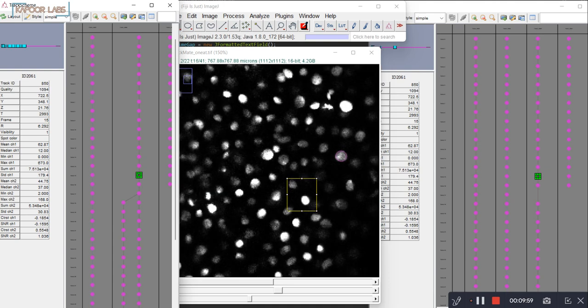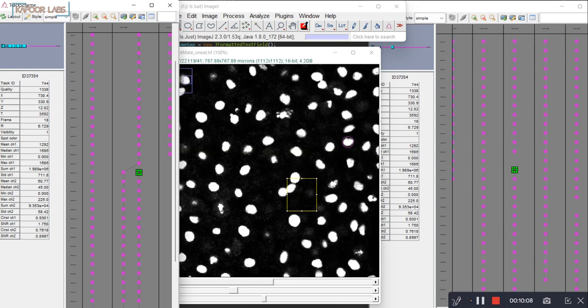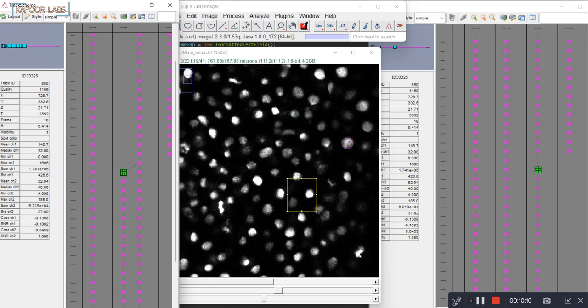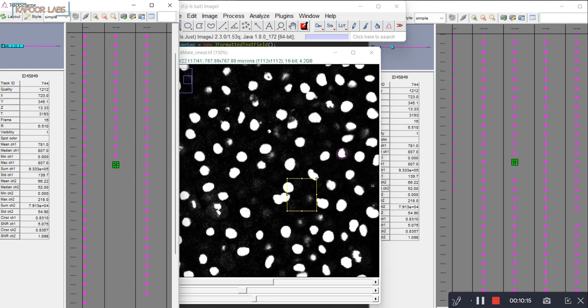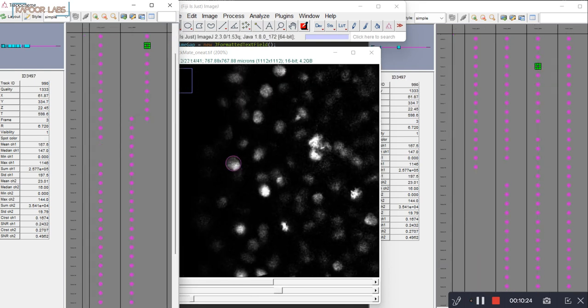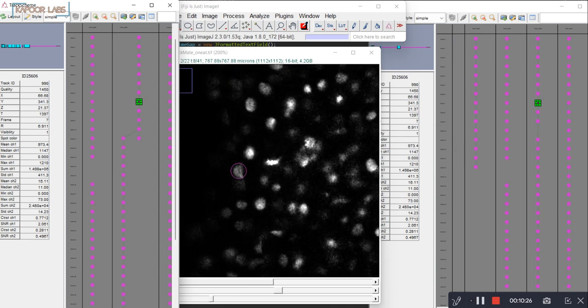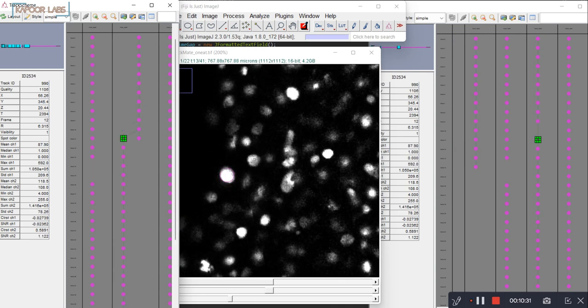I don't know why TrackMate found this as a division, because here clearly this is not a dividing cell, and I do not see any cell next to it also undergoing division. So it was nice that this link was broken, right? And another example here where TrackMate found a mitotic cell, but Oneat didn't consider this a mitosis, so it was also broken.